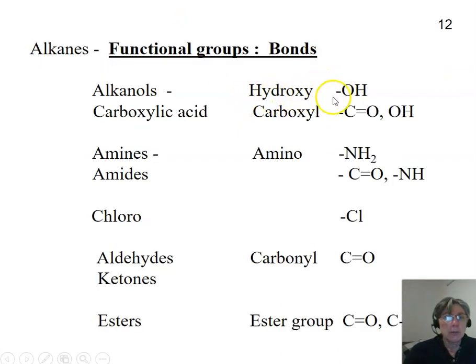Okay, so what we are looking at are our functional groups. There's only a few, really. The hydroxyl group, the carboxyl group, which we'll have 2 different peaks for, the amine group, and the carbonyl. So we've got carbonyl, hydroxyl, and amine, and these other ones we don't really use. And there's also the double bond. I need to put that on here too.